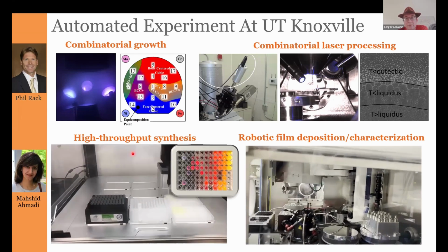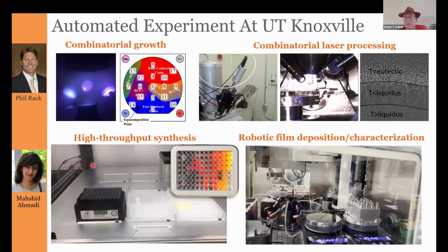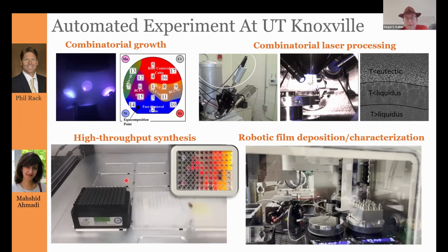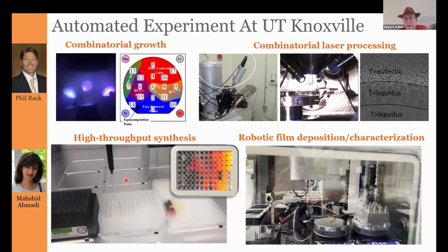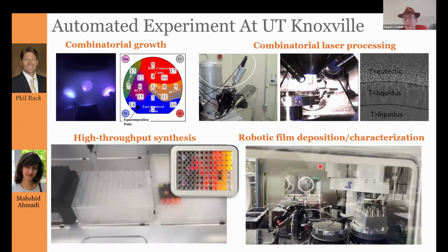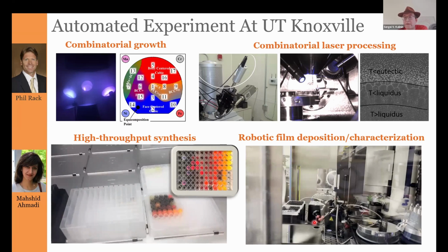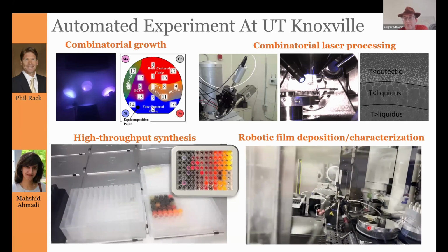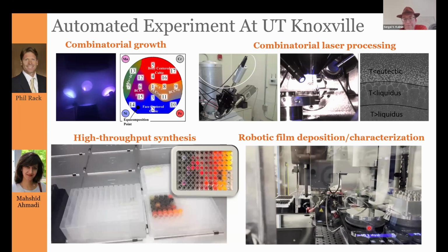We started with a small Opentrons robot that allowed us to increase the throughput for hybrid perovskite manufacturing by about a factor of 100. This effort grew to multiple robots and a spin board that allows in situ synthesis and characterization of the film. You can drop cast the film, put it on the plate, anneal it, and detect the PL signal in the process.